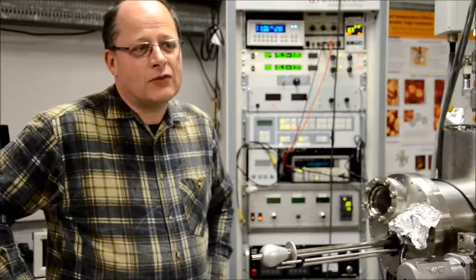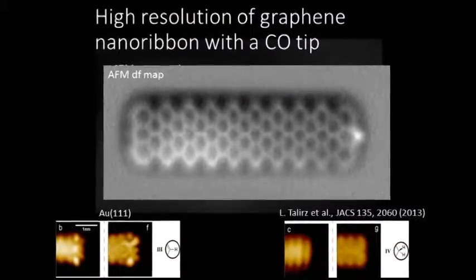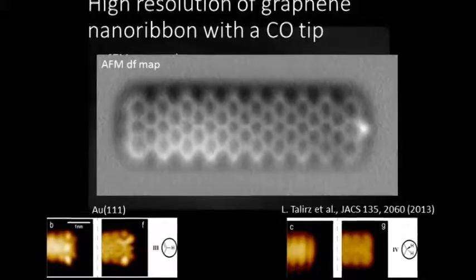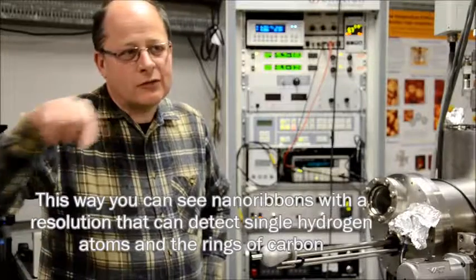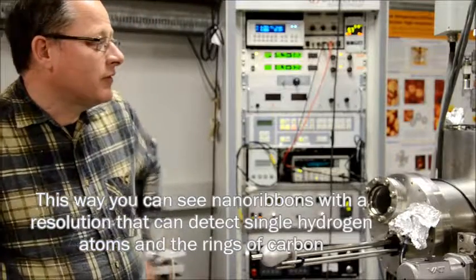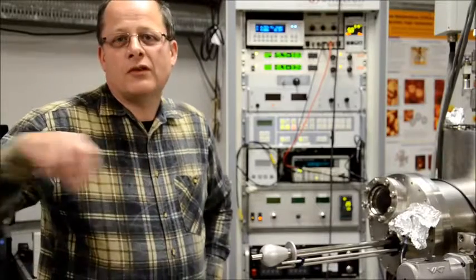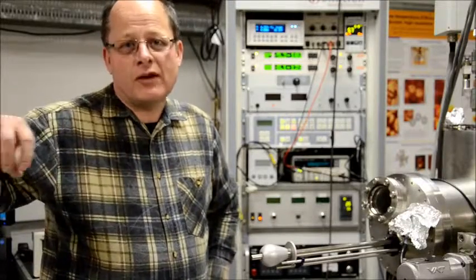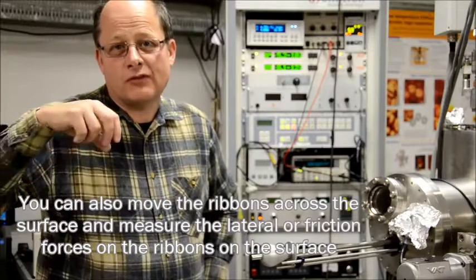So we can see, for example, nanoribbons with a resolution where you can even detect single hydrogen atoms, and also see the rings of the carbon. And in addition, and that's the most recent thing we did here, we can move the ribbons across the surface and measure the lateral or the friction forces of these ribbons.